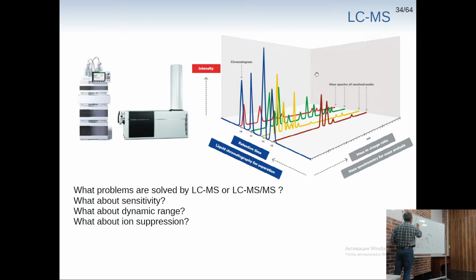You will fragment it somewhere afterwards. Then at this time, this ion is in the temporary blacklist. It will not be fragmented. And you have this ion which happens here, and you will fragment it not on the top, but somewhere here. And since the 3 seconds or 10 seconds have not yet ended, you will not fragment anymore. Is this approach feasible to get high sensitivity?